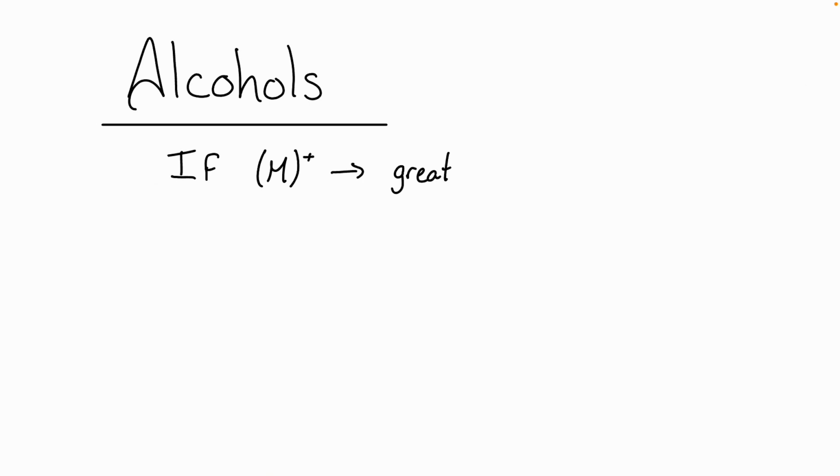Alcohols are a son of a gun in the mass spec. They never, I don't want to say never, they very rarely survive as molecular ions in our mass spectrum. So we're often trying to make sense of just the fragments, not the end one, right? We can't do our number of carbons prediction with our alcohols. Okay? So if we have an alcohol, we got to be a little bit more careful in analyzing our spectrum. Okay, so we could say if we have our molecular ion, great, fantastic. Okay, but often we do not.